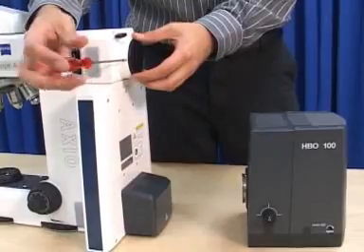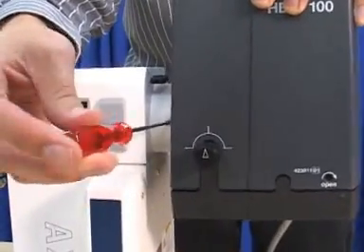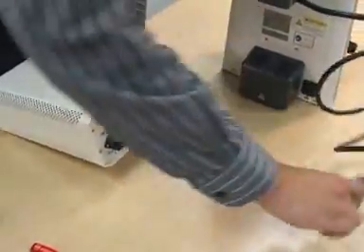Attach the HBO 100 lamp housing to the dovetail mount at the back of the microscope. Tighten the fastening screw with the supplied ball-headed 3mm screwdriver. Connect the cable from the HBO lamp housing to the HBO power supply.